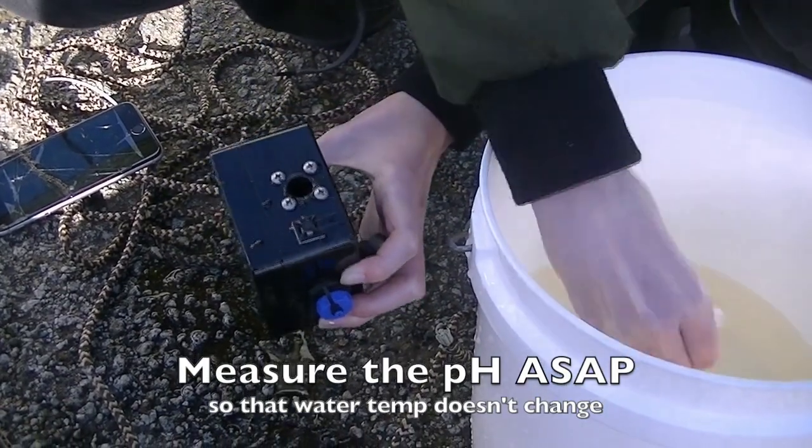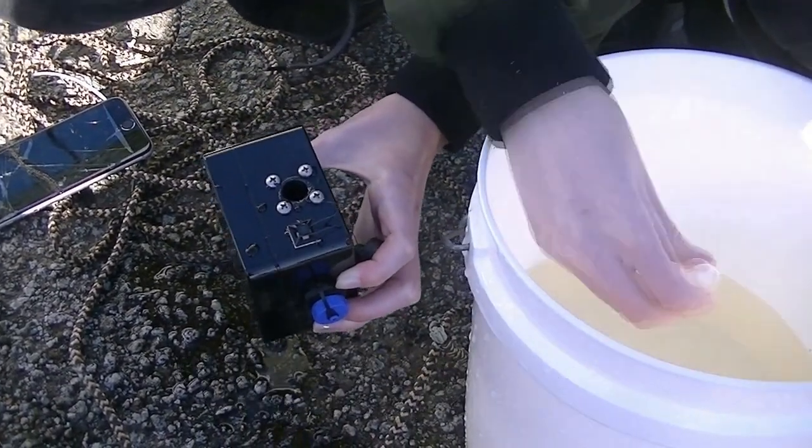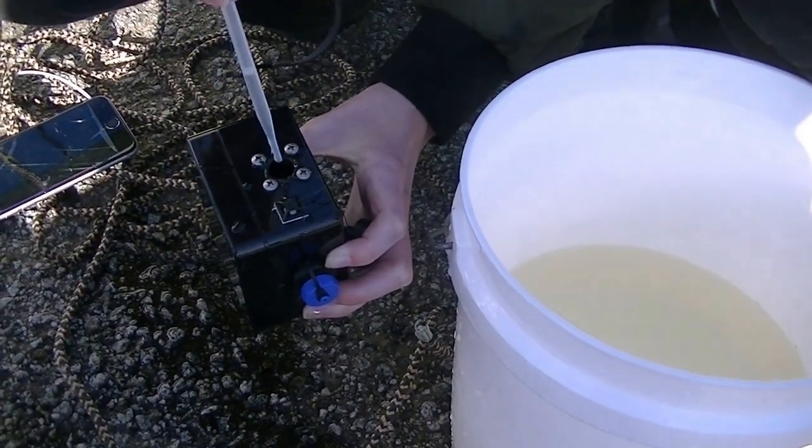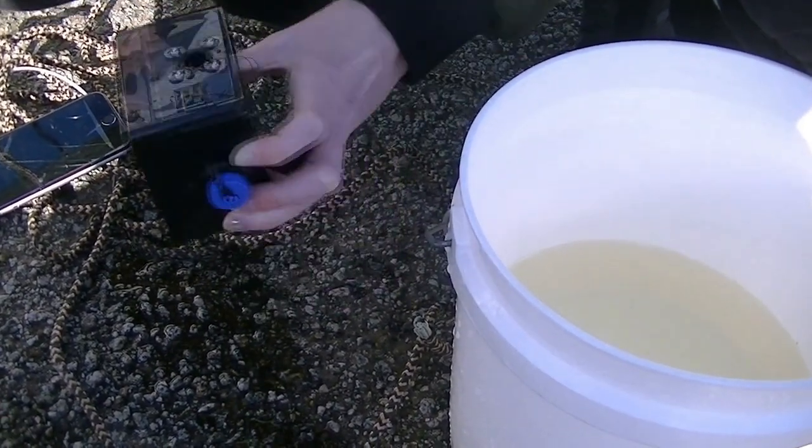Now we're ready to measure pH with the Phyta. First, rinse the cell out three times with seawater to bring the cell to the correct temperature.